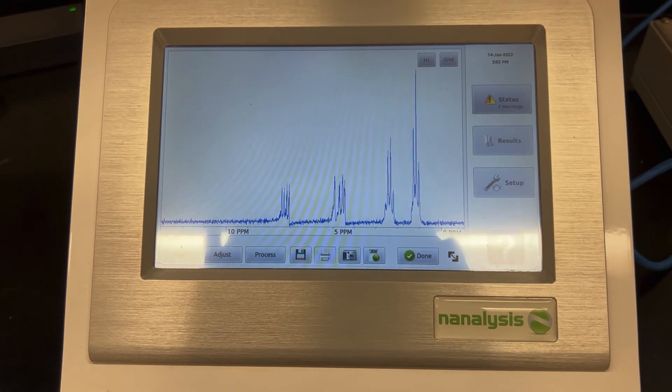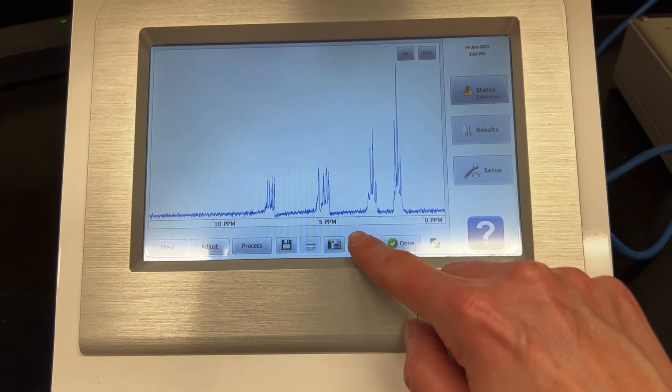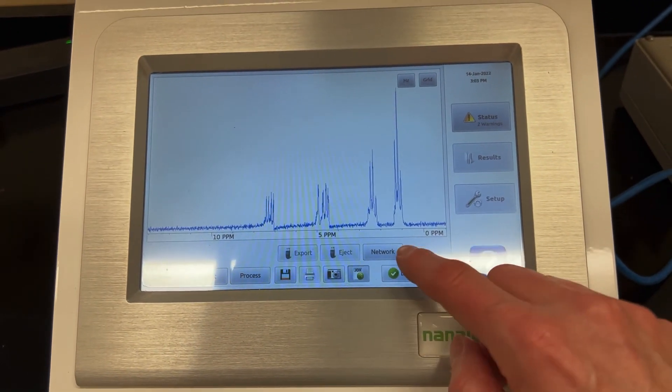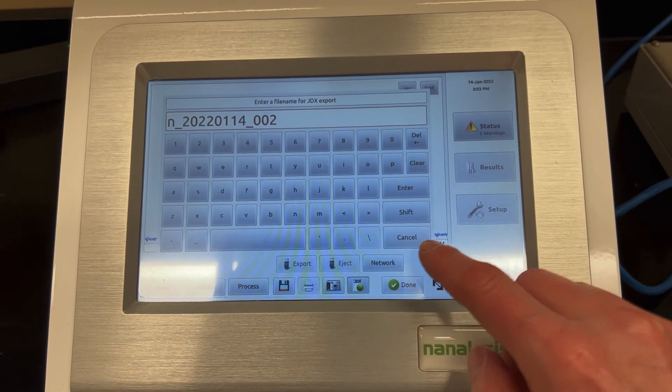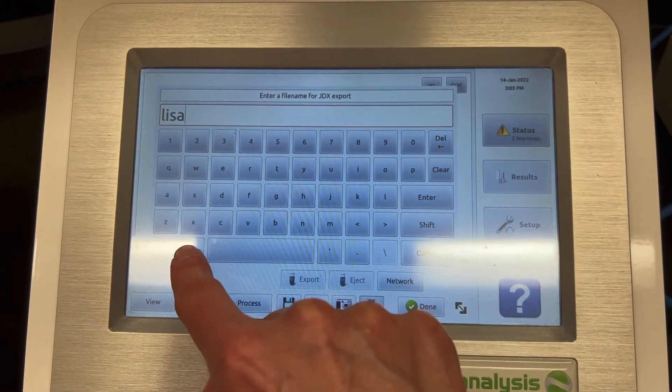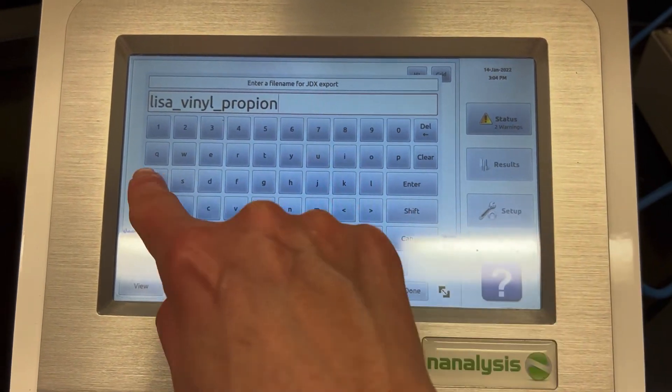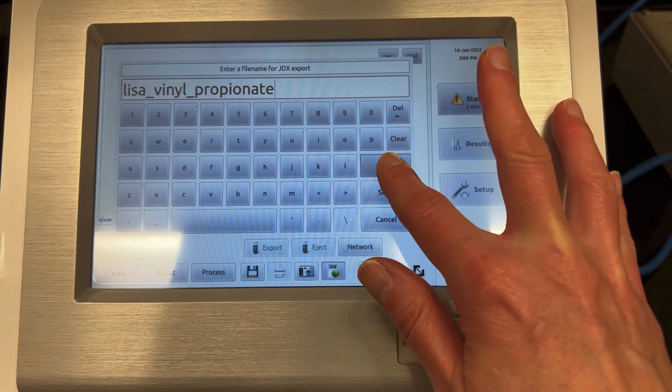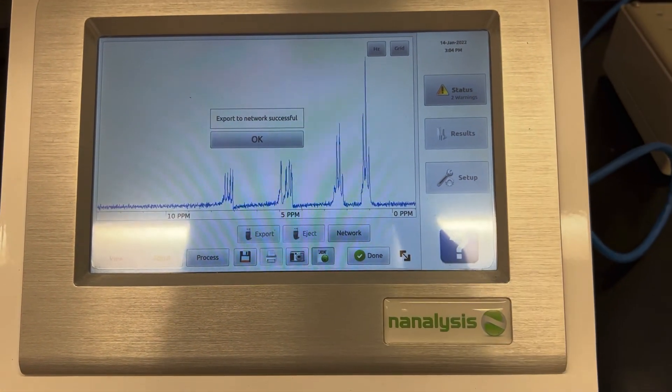The spectrum is now done. All you need to do is save it, so you're going to push the JDX button then the network button, and then you can just remove the auto-generated name, type in your own name and push enter, and then that is sending the file to the computers.